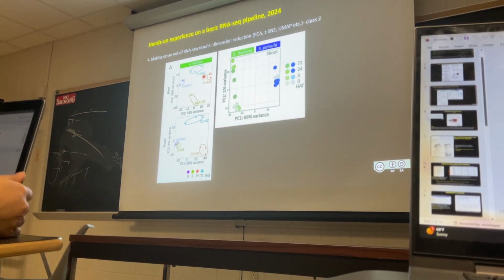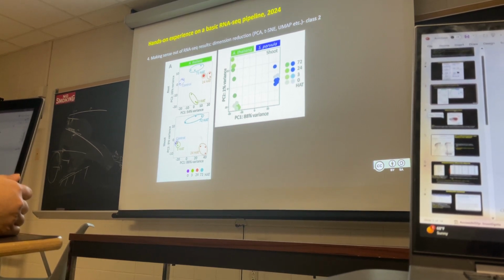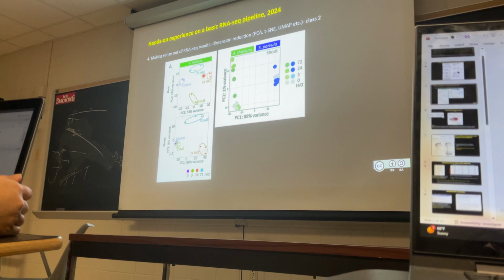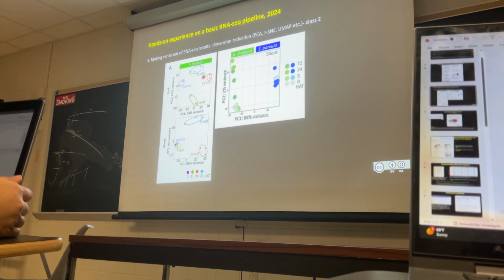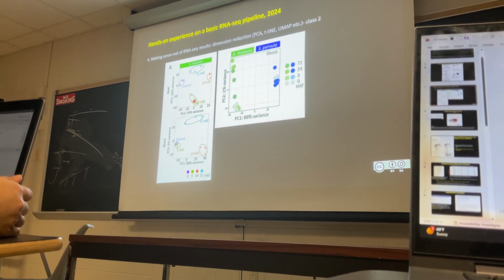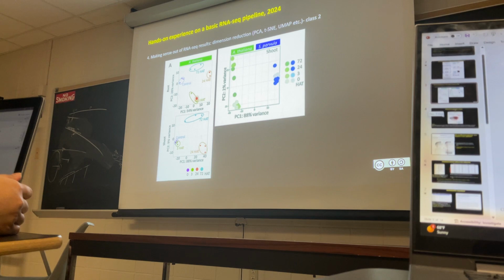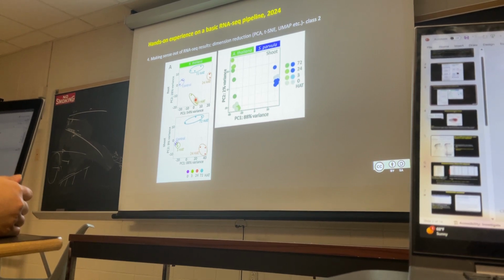You can visualize this type of dataset and see how the biological replicates are behaving. If you are dealing with field samples, as in most ecology or similar experiments, it is very difficult to have samples that agree with each other or have similar transcriptomic profiles. So having multiple replicates will help your analysis.